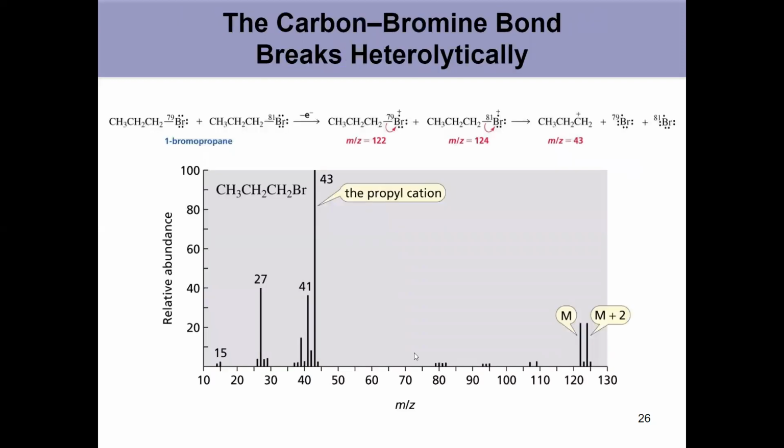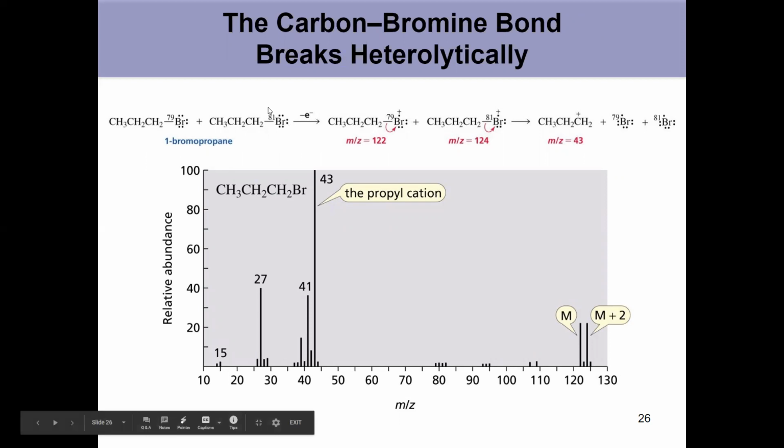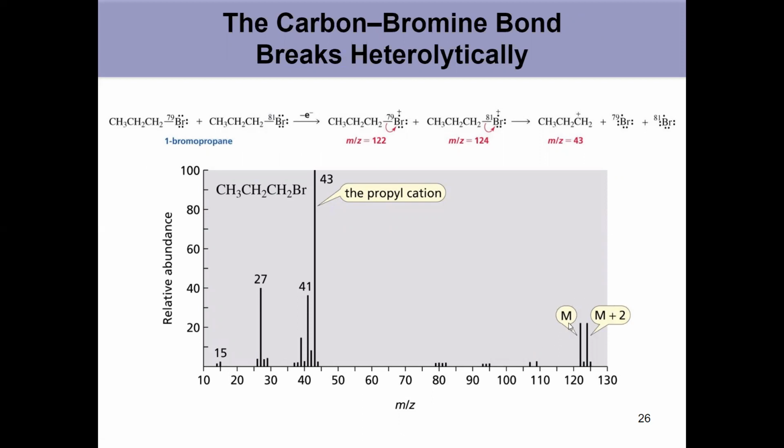Okay. So again, let's look at these alkyl halides, looking at bromine and chlorine. So what are you looking for here? Here's the clue. If you see a molecular ion peak, which on a test would always be labeled for you, okay, I will label the molecular ion peak. So if you see another peak at M+2 AMU there that is pretty much the same height, a 50-50 split, you are confident that you've got bromine in your molecule. So make sure you've got that in your notes. M and M+2 same height, presence of bromine.